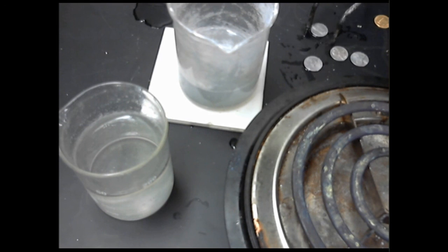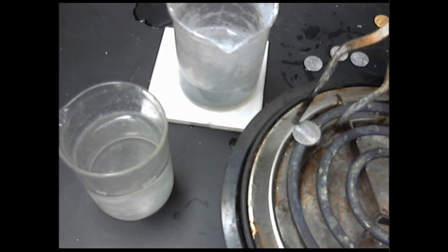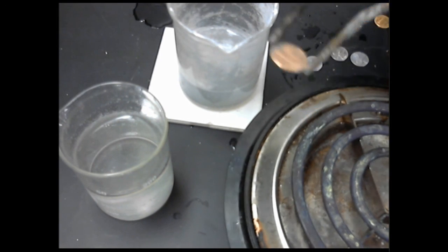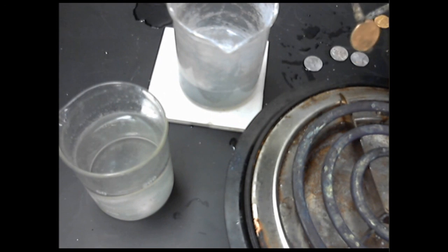Let's do just one more. I'm going to take this silvery, shiny penny and place it on the hot plate so it's in contact with the heat for just a few seconds. I'm going to watch very carefully to see the moment that the penny changes back from silver to sort of a coppery color once again. The moment the entire penny is coppery, I douse it in the water, and we have a gold colored, actually a brass penny.